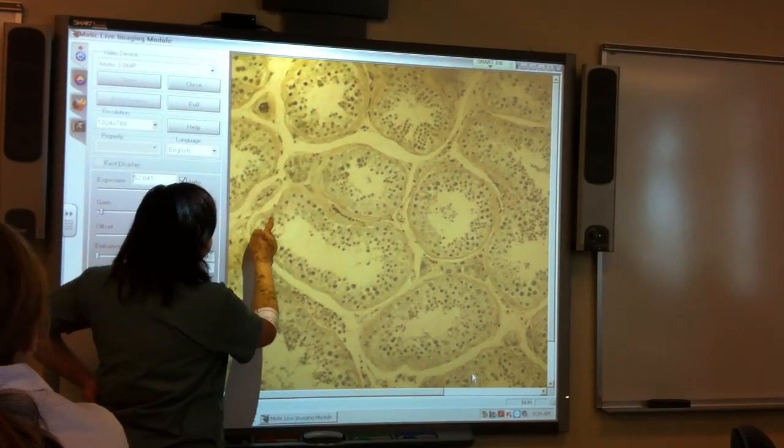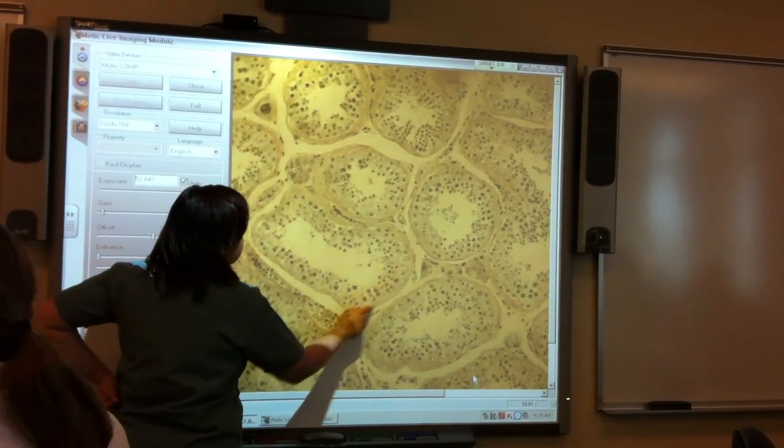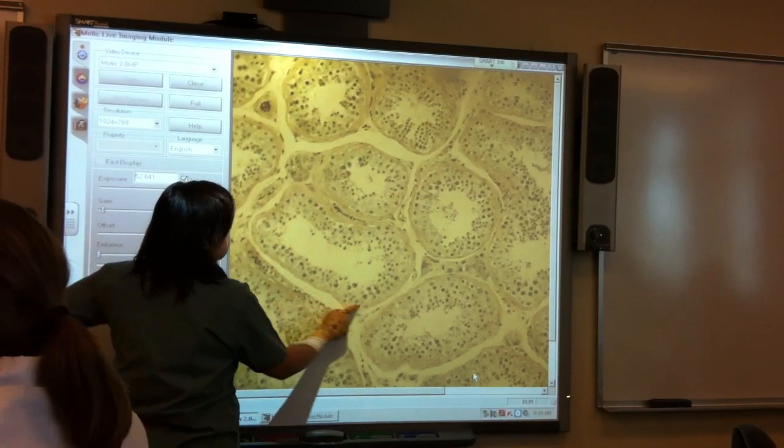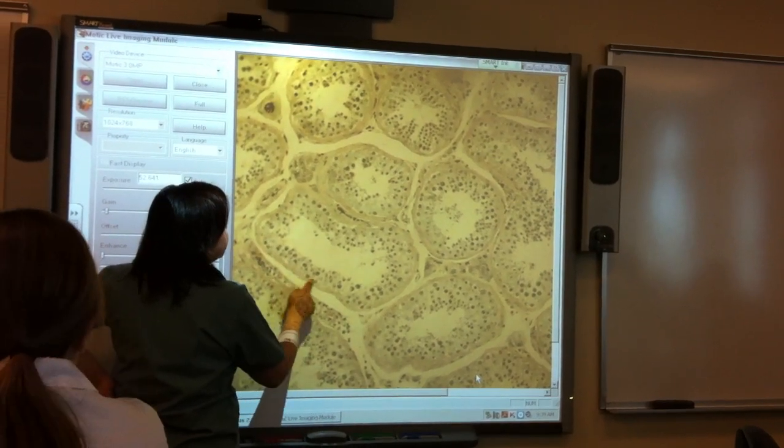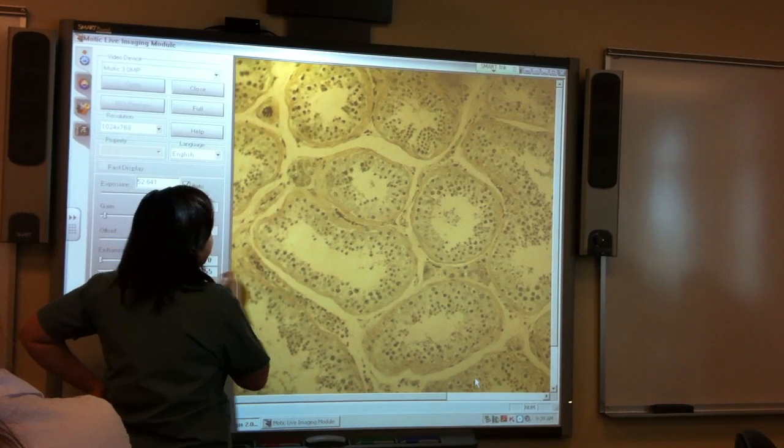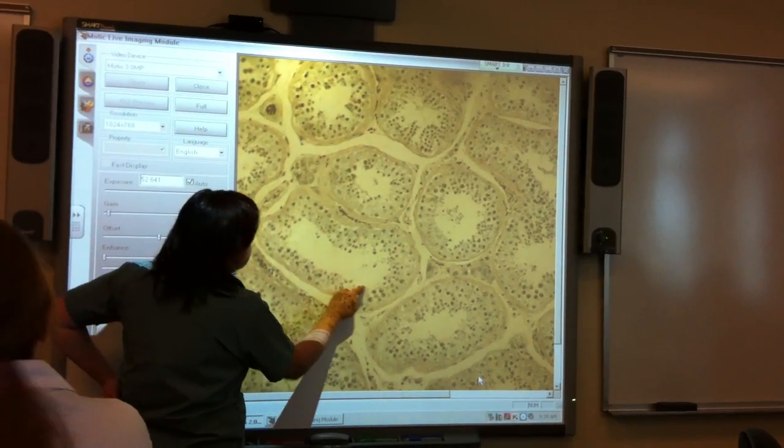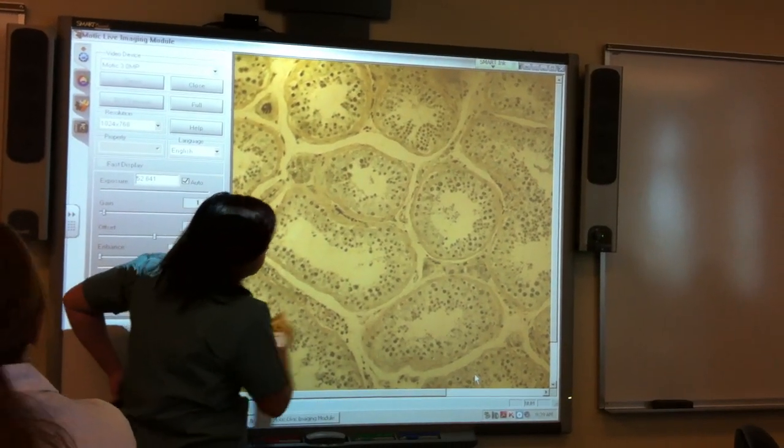Interstitial cells. The first ring of cells in the tubule is what cell? Spermatogonia. The innermost ring of cells? Spermatids. Spermatids, yep.